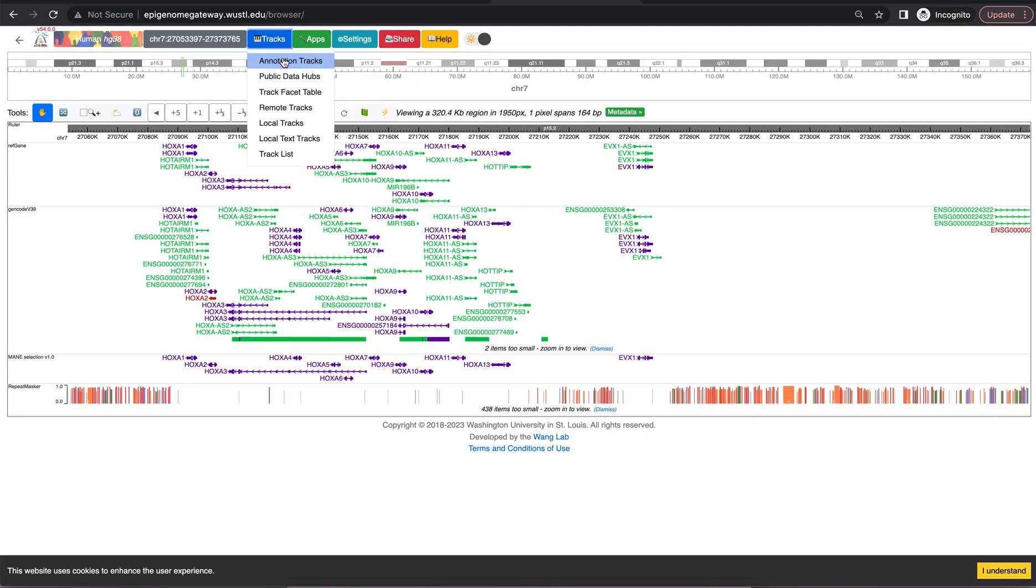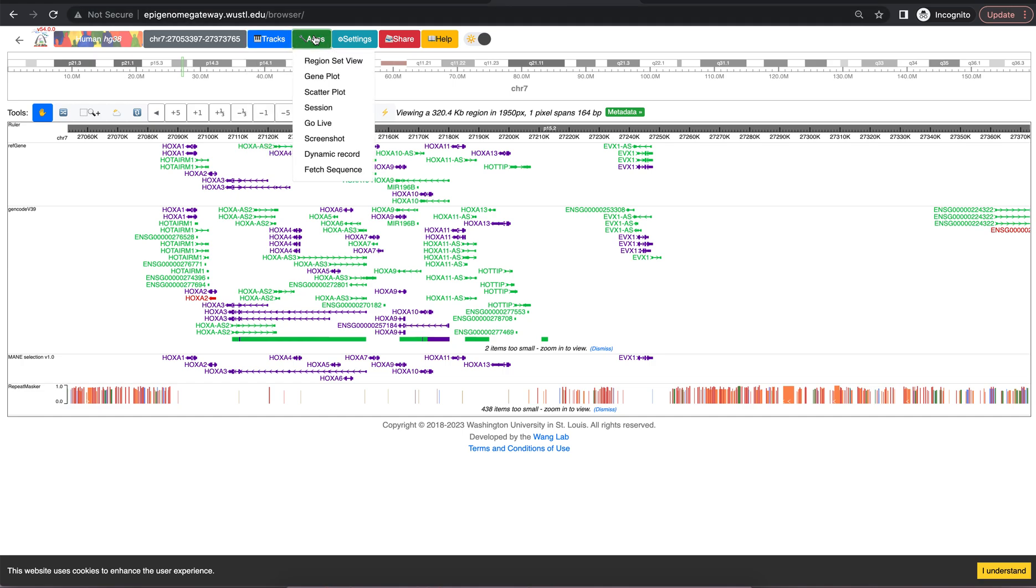The tracks button allows you to load your own data or load publicly available data. Apps contains specific features such as screenshot.